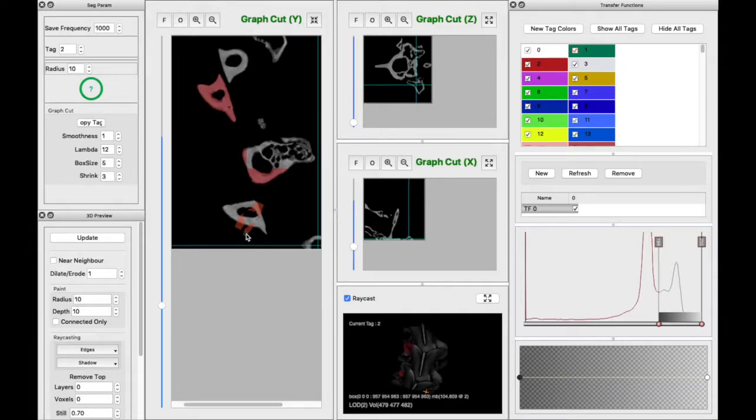So I think what will work, because our desired vertebrae is going from extending a long way over here to just getting smaller and smaller, the best way to go about this, I'm feeling, is to put some good old 255 right there, and that'll prevent the red from going over there. Because I'm not gonna press P right now, it won't erase what's already there, but it'll keep it from going over into that area, I'm thinking.